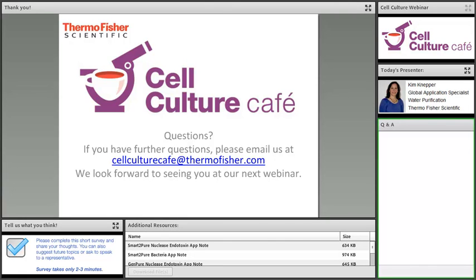Okay, great. It says, our water system display reads around 1 or a little higher than 1. What type of water is this? So that could be considered a Type 2 or Type 3 water supply. So it would kind of fall between the Type 1 and Type 3. I'm sorry, Type 2 or Type 3.